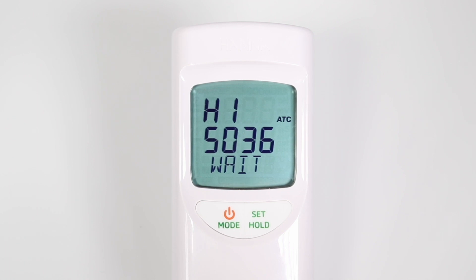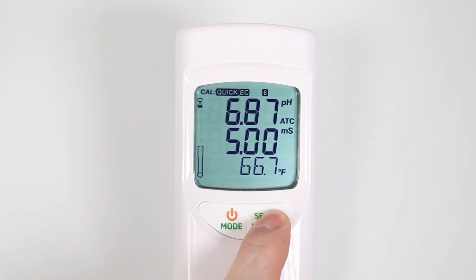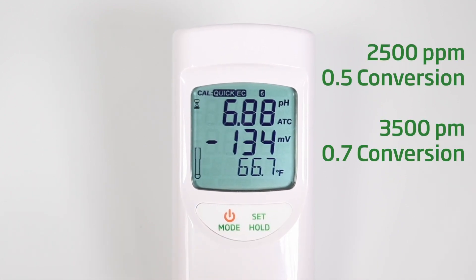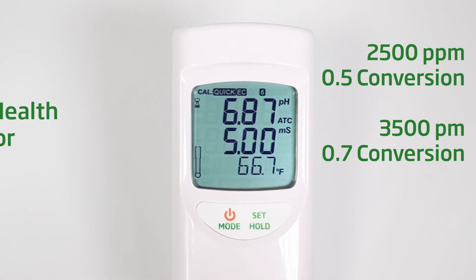Wait until save appears on the screen. Your meter is now calibrated and will return to measurement mode. You do not need to press anything to save the calibration. It should read within a few hundredths of 6.86 depending on the temperature of your calibration solution. Your EC should read close to 5.0 millisiemens. Your PPM will read close to 2500 parts per million if your conversion factor is set to 0.5, and 3500 parts per million if your conversion factor is set to 0.7.